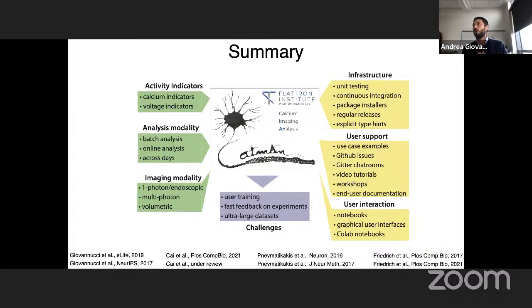So if you remember electrophysiologists 35 or 40 years ago, they were basically listening to spikes. And while they were doing an experiment or changing something, they had immediate feedback about what's going on. If you think about the modern experiments with imaging, you are lucky if you're able just to keep up with what's going on, in terms of software and hardware. But what would be needed is some way, visual or audiovisual, to communicate what's going on in your experiment in real time. That's why we are now developing algorithms that very quickly can extract the activity of the brain and give you an idea of what the brain state is.